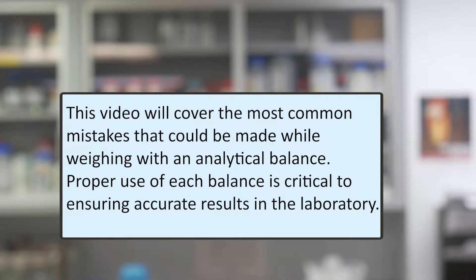This video will cover the most common mistakes that could be made while weighing with an analytical balance. Proper use of each balance is critical to ensuring accurate results in the laboratory.